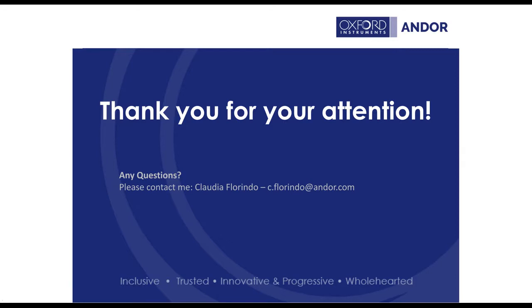I hope that after these presentations, you would be convinced of how powerful the zebrafish model is for live imaging, that you would also consider all the great improvements that have been done on the spinning disk microscope, and all the things that you can achieve with it. So yeah, that was my final words.